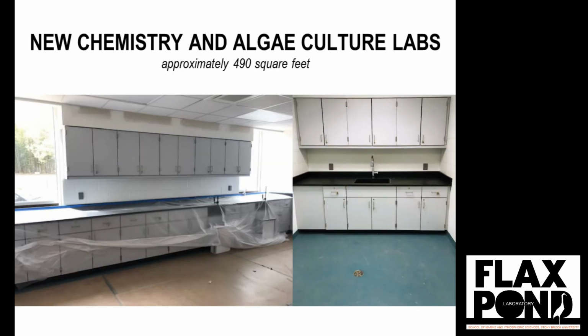These are our 2 new laboratories in the front end of the building. That was that light blue area on the diagram. On the right is an algae starter culture lab. It is built specifically to keep small samples of algae, but can also be used to keep small marine organisms. Both of these labs have running seawater and floor drains.